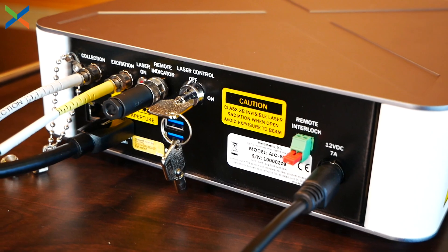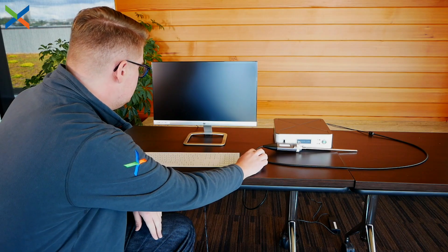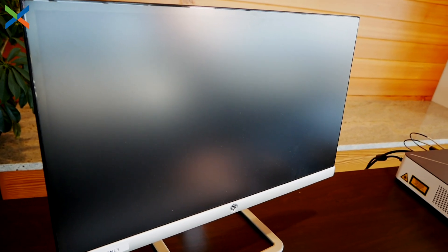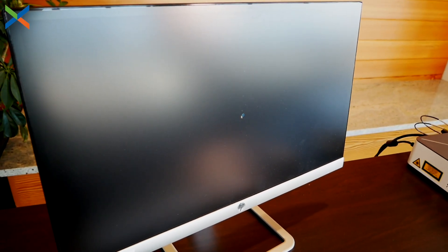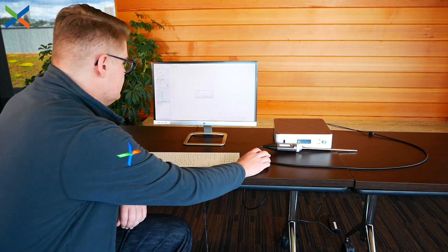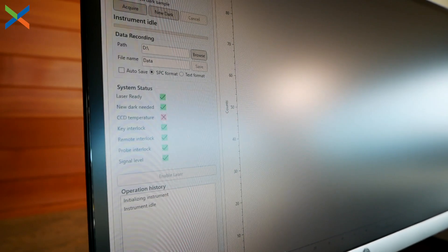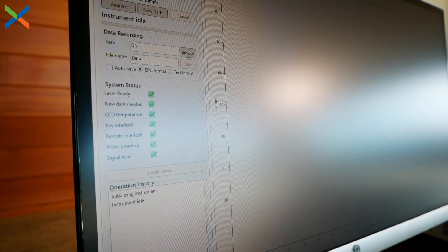Once you have everything plugged in, it's time to turn it on. Hit the power button and you'll hear the fan kick on — that'll let you know the system is on and working. Soon you should see the display pop up, go through a startup screen, and then you should see a Windows icon, which lets you know the device is plugged in correctly. This startup process usually takes about five minutes. It's important to note that there is a software interlock as well as a physical interlock. Before you take your first sample, grab your mouse and click to enable the laser. Make sure all of the system status check boxes on the left side of your screen are green before you start sampling.